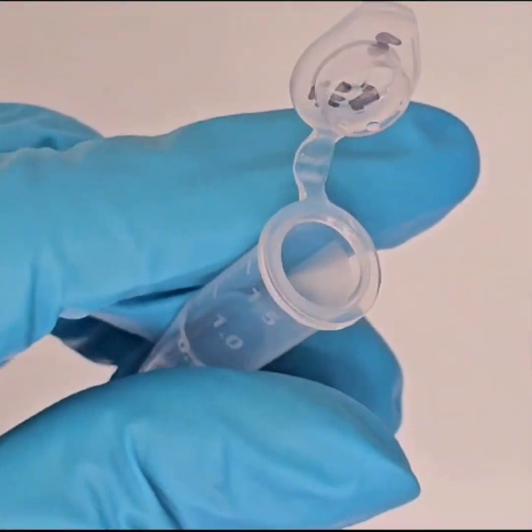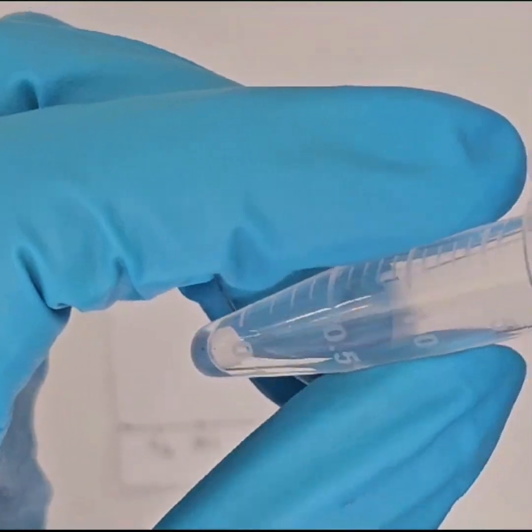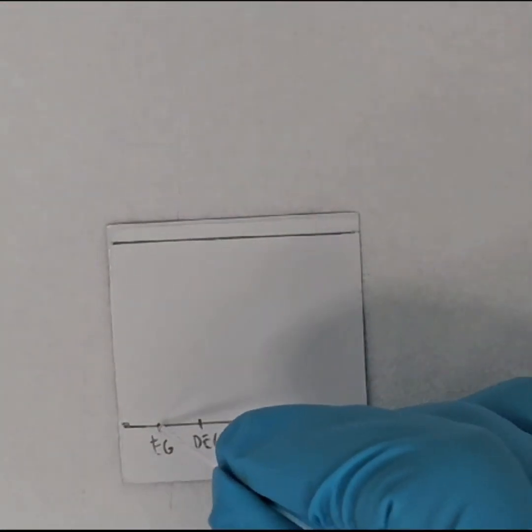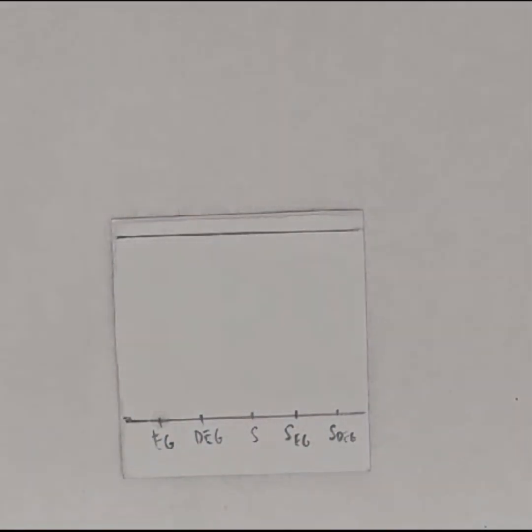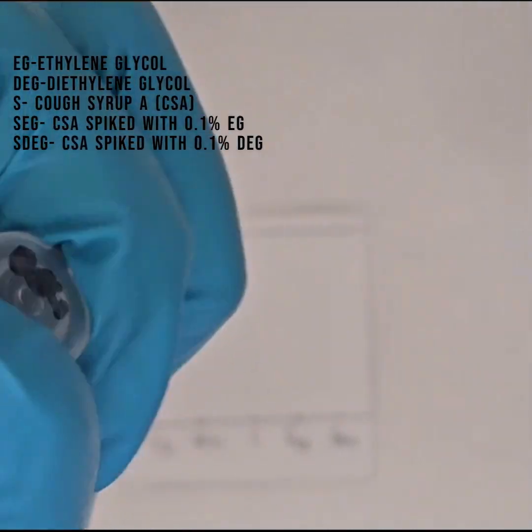To achieve this, firstly, insert the capillary into the sample to collect some liquid. Next, briefly and gently tap the end of the capillary onto the TLC plate so that some of the sample is spotted on the plate. Repeat these steps until all the samples are spotted on the plate.